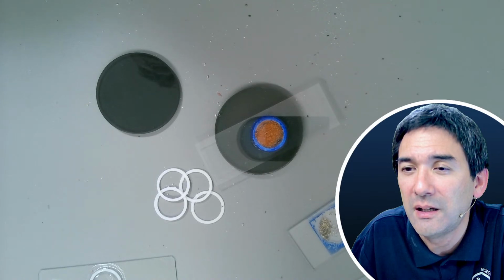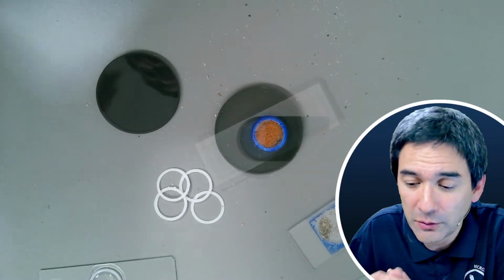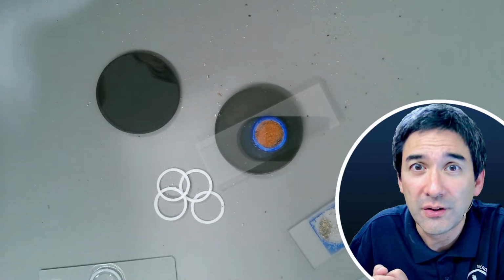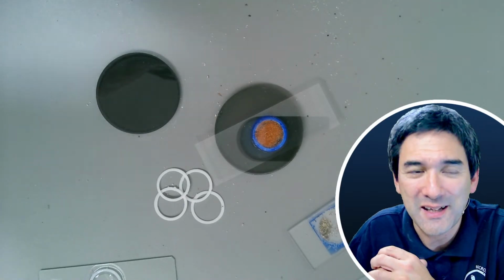Sand is amazing. It can hold so many different minerals. Yes. The sand samples today, unfortunately, I was not able to see any foraminifera, radiolarians, and so on. There are certain regions in the world that are full of these. These are shells of protists. Unfortunately, I was not able to find them here today. Many of the sand samples here contained a lot of quartz sand, but there are also other sand samples around that contain more biological material. So maybe I'm going to check my other sand samples as well.